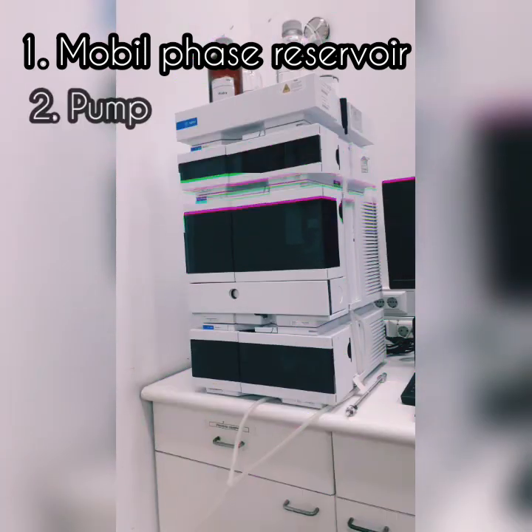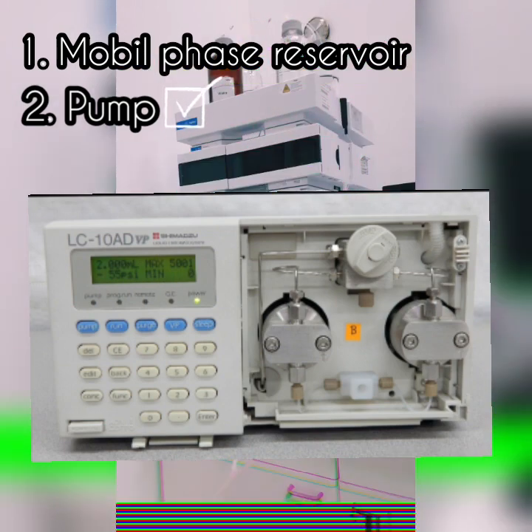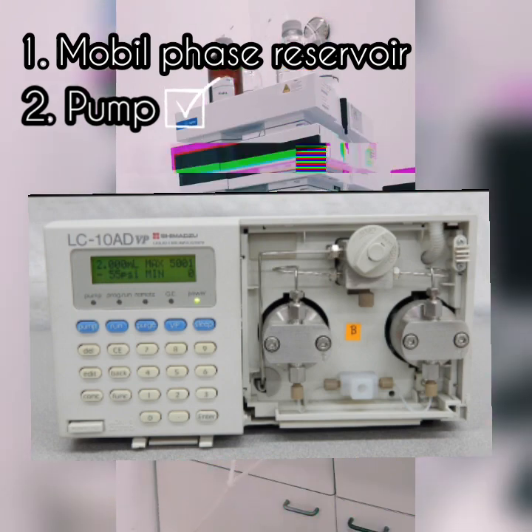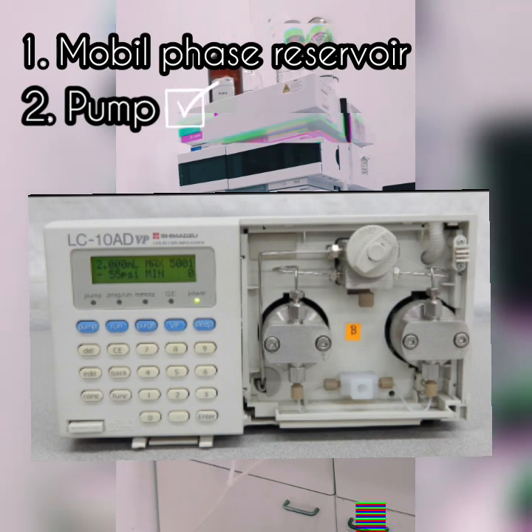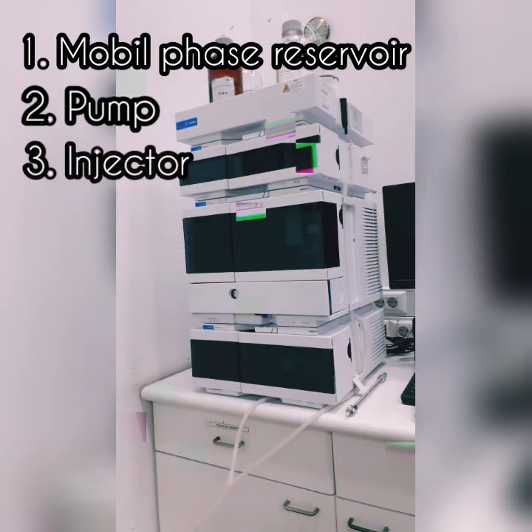Number two, pump. A pump aspirates the mobile phase from the solvent reservoir and forces it through the system's column and detector. Depending on a number of factors, including column dimensions, particle size of the stationary phase, the flow rates and composition of the mobile phase, operating pressure of up to 42,000 kilopascals, about 6,000 psi, can be generated. This is for pump.